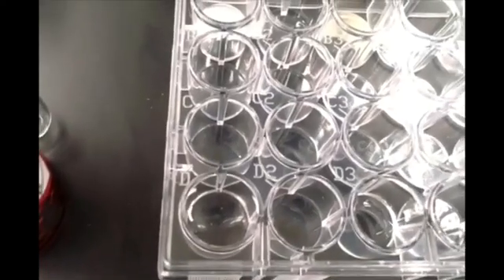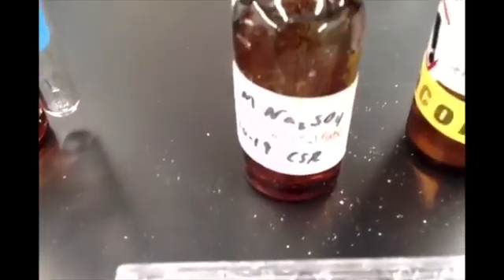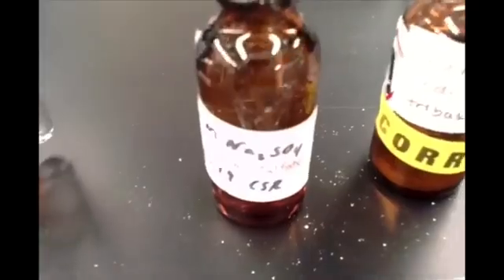no precipitate forming. Alright, for this one we're going to take our calcium nitrate and add a few drops of sodium sulfate. Alright, so let's go ahead and add that in there. So we'll do that in this cell over here.